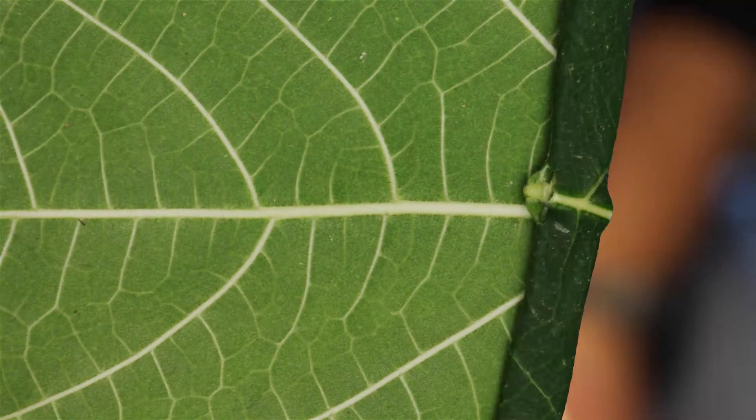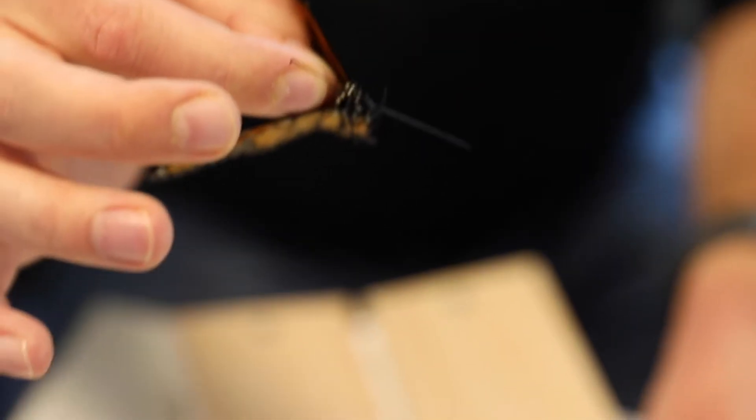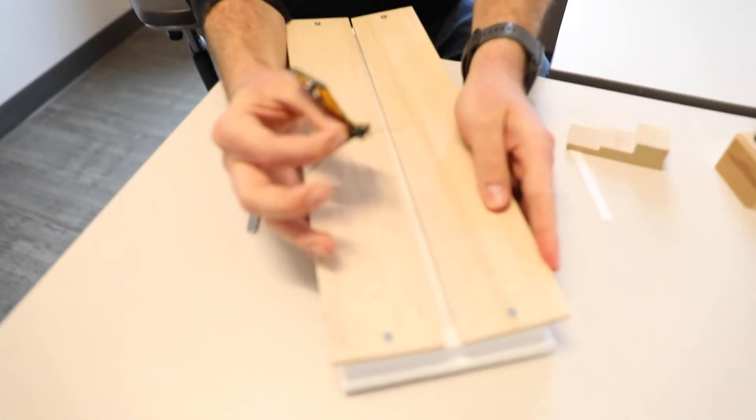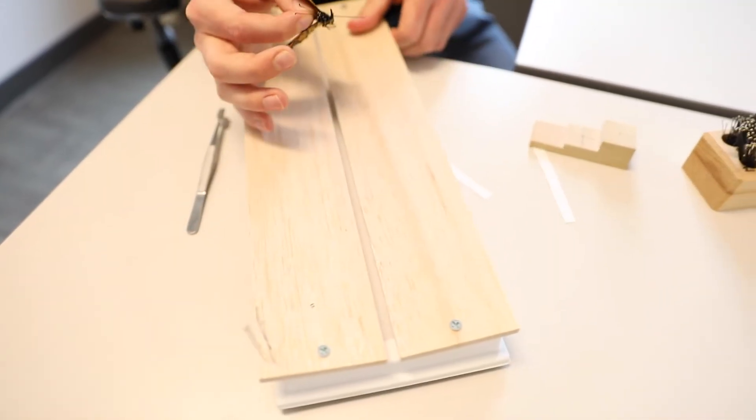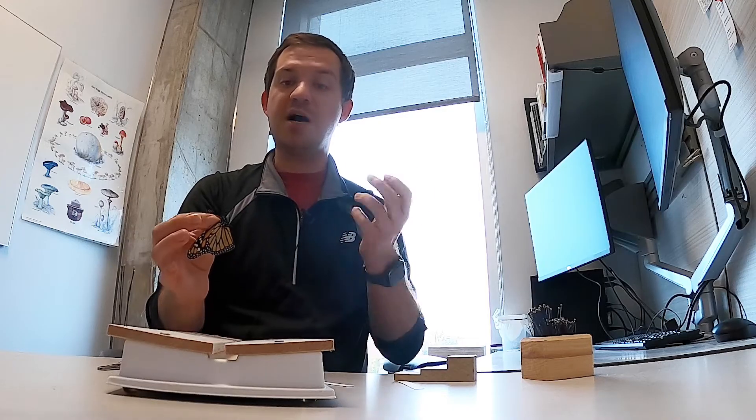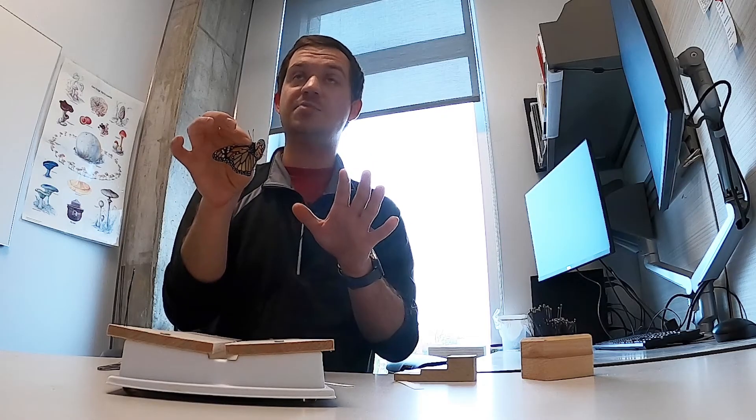In general you want an insect pin to be sticking out of your specimen about a centimeter. For the actual pinning portion, we have this spreading board here that has an adjustable width - these little wood sections can move in and out a little bit. What you want for butterflies and moths is for that section in the middle, which is going to be for the butterfly's body, to just barely fit inside that crevice. You don't want there to be too little space where you're damaging your butterfly by shoving it in, and you don't want that space to be too big.